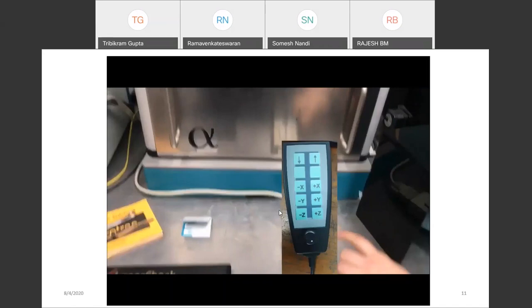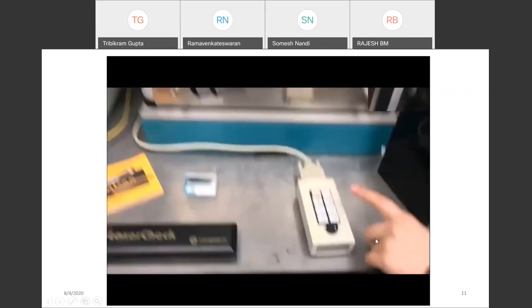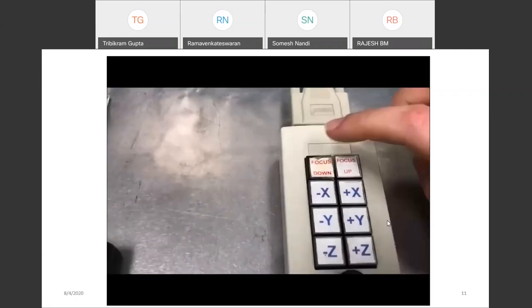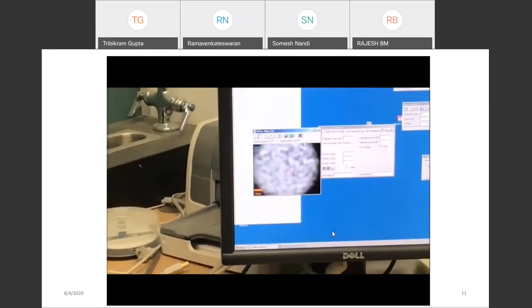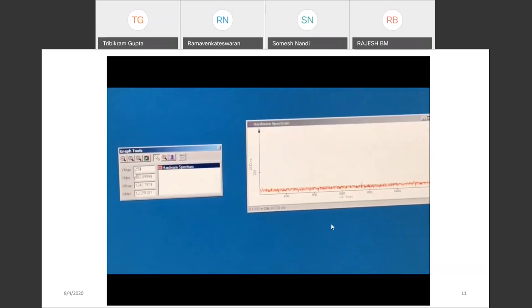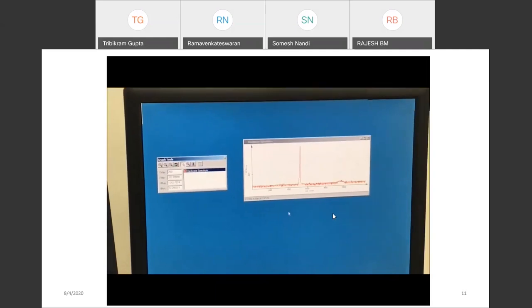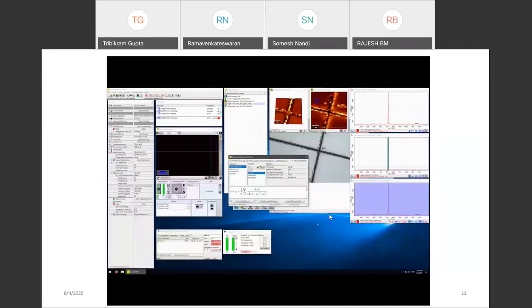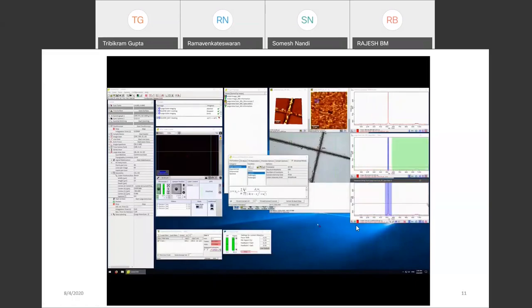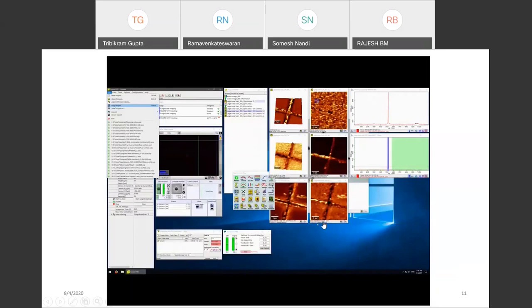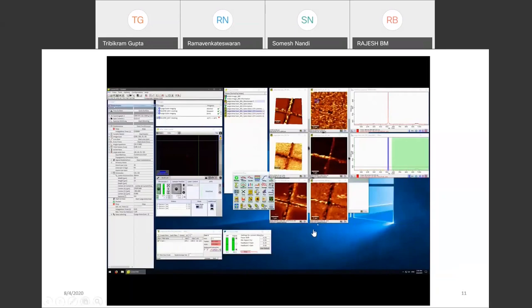To focus the sample using the optical microscope, we can use a remote controller or joystick to move the piezoelectric stage along the three axes. After focusing the sample, we extract the Raman spectrum. I am selecting the peak of interest — the peak height, peak width, and peak position — and all the data can be exported and stored on the computer.